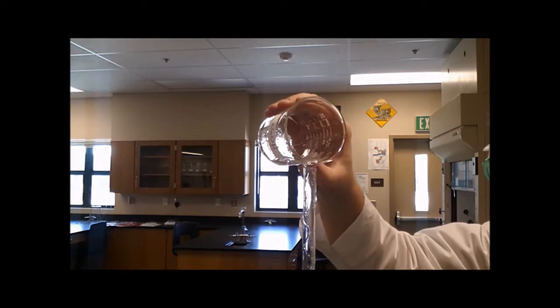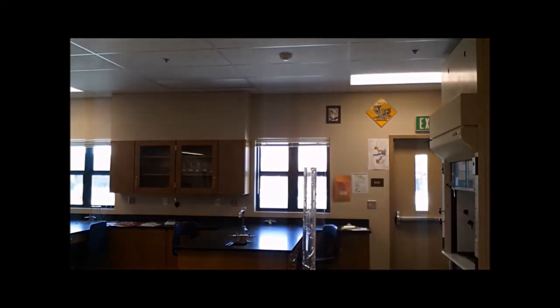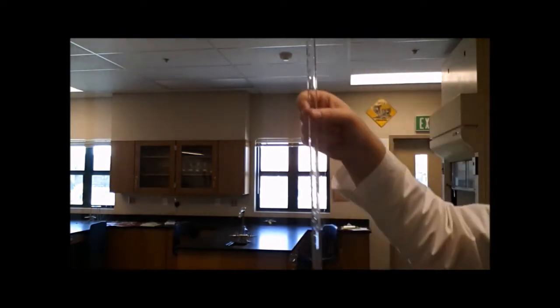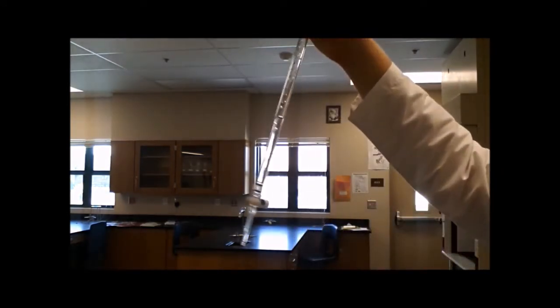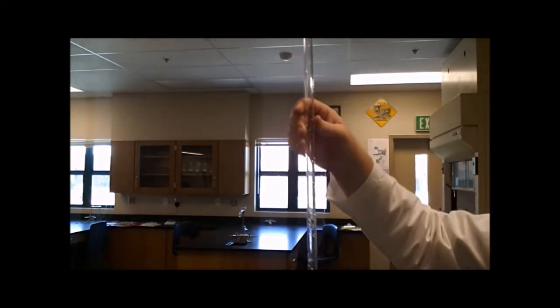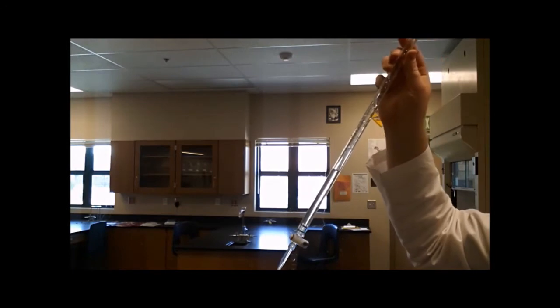I don't want to use too much. Not much more than 7, 8, 10 mils. What I want to avoid is filling this up to the 50. I'm not filling it up very much, and not all the way to zero, because if I did that, I'd be wasting all the sodium hydroxide. What I'm going to do right now is rinse out the burette.